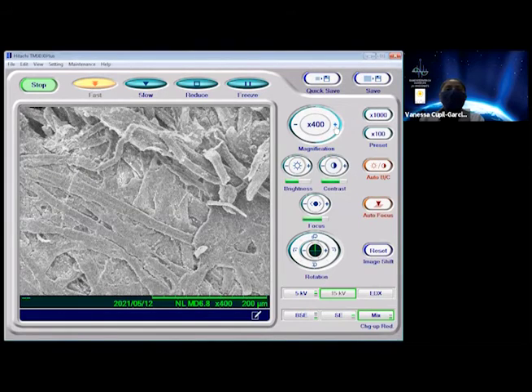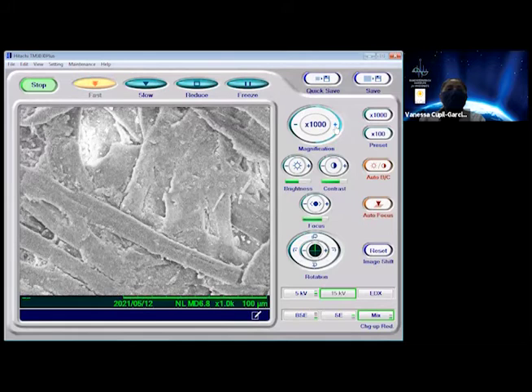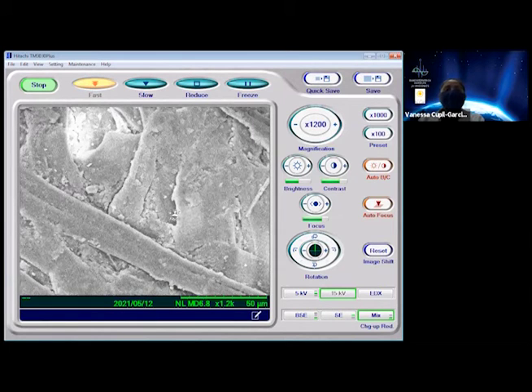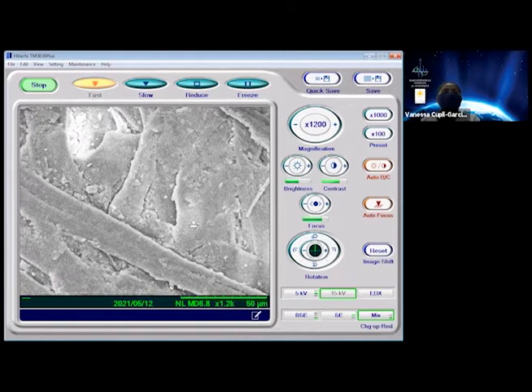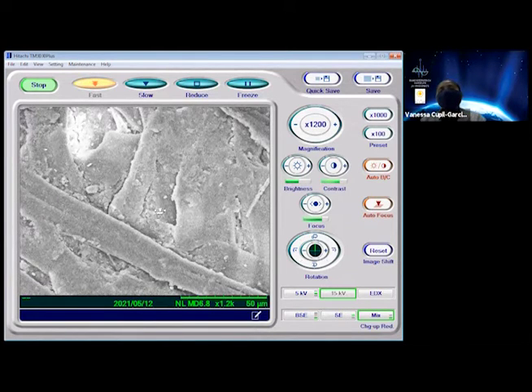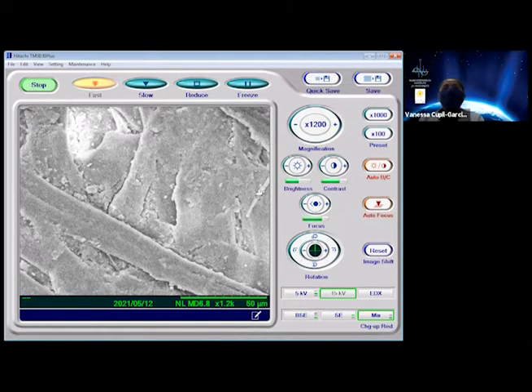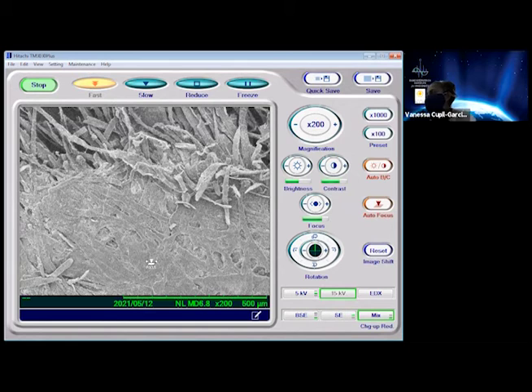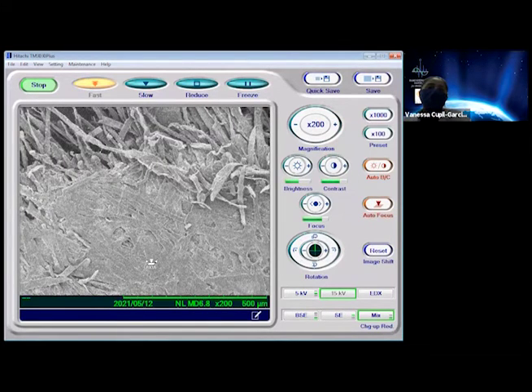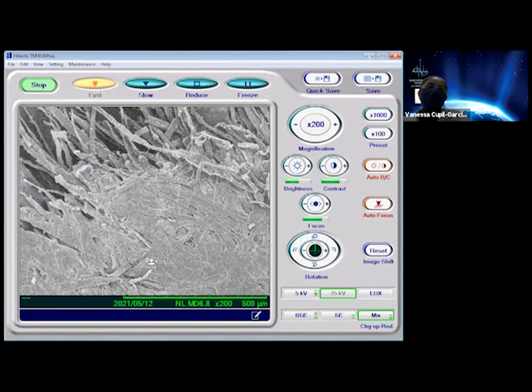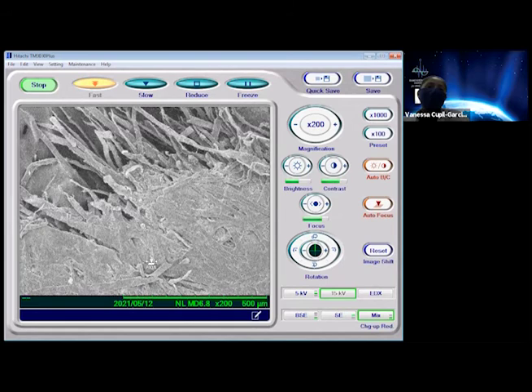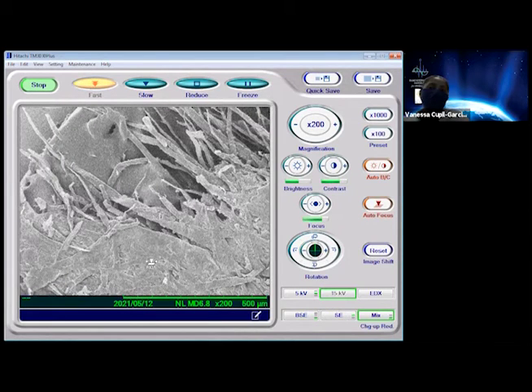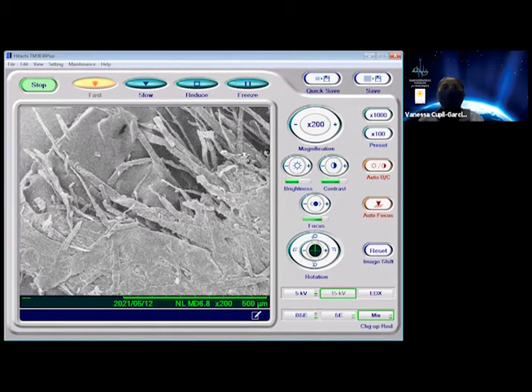And if we increase magnification, we can see them in much finer detail. So you can see the separations between them where they overlap. And because this is paper and it's already been condensed down and the cellulose is packed, we see it like this. But if this was a piece of bark or a piece of tree, we would be able to see the cells. And we can zoom out some more and we can move the sample by adjusting the stage. So here we can move right and we can see more of this piece of paper. And you would never think a piece of paper would look this cool under a microscope with all these different patterns.